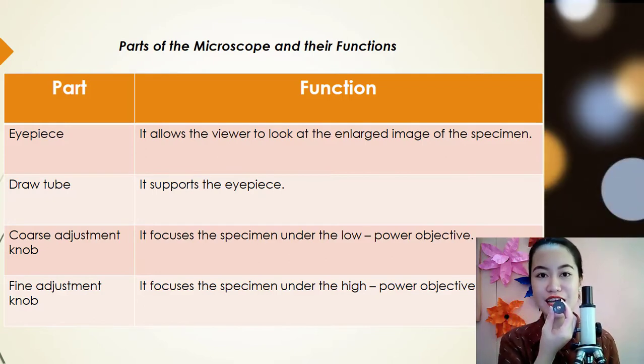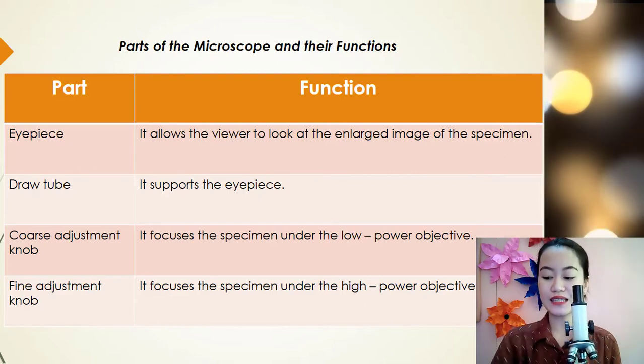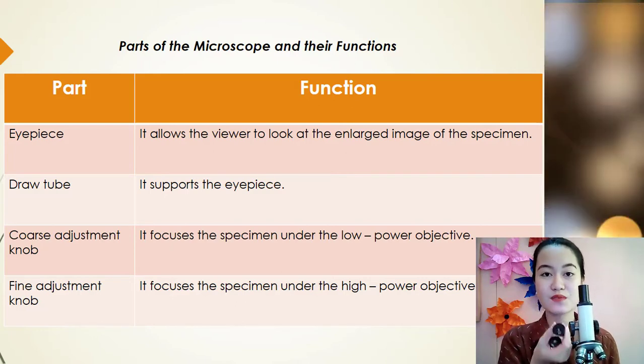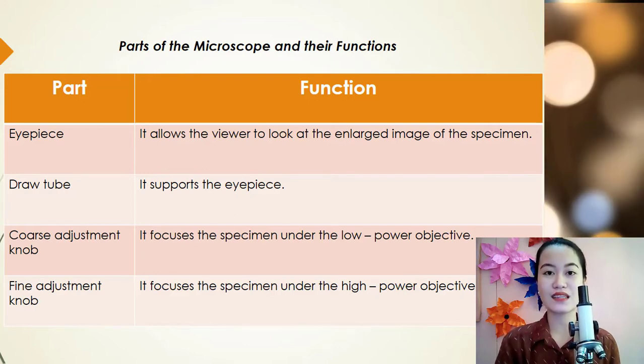We have different types of lens. We have the 10 times, 15 times, or 20 times. So this is the 15 times. Pwede nating makita kung gusto natin ay mas malapit. We use 20 times pa. Meron tayong 20 times.